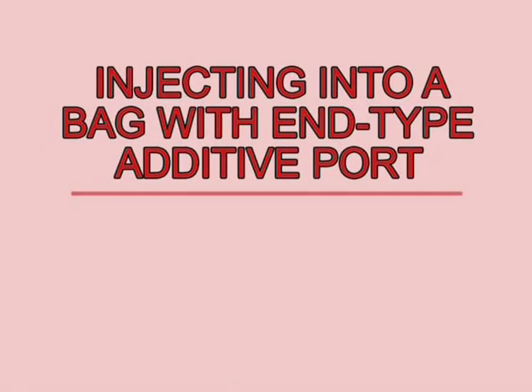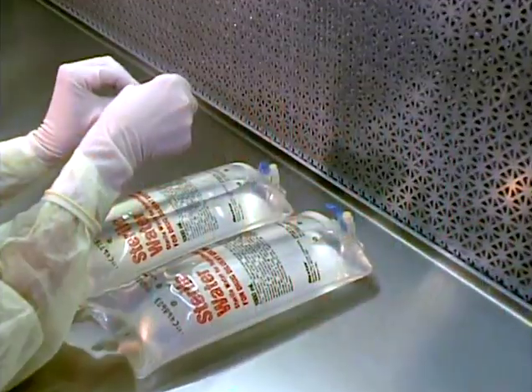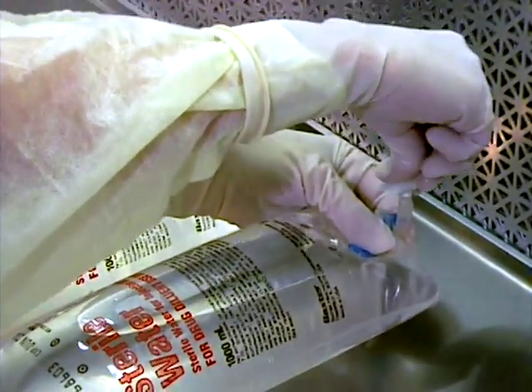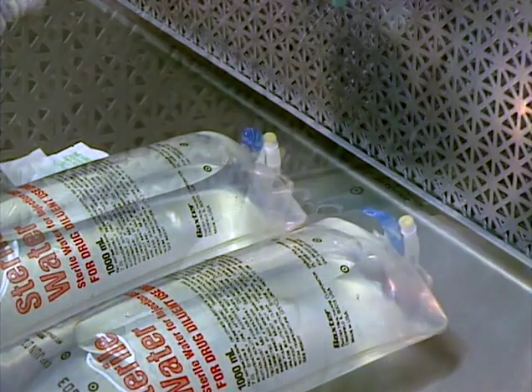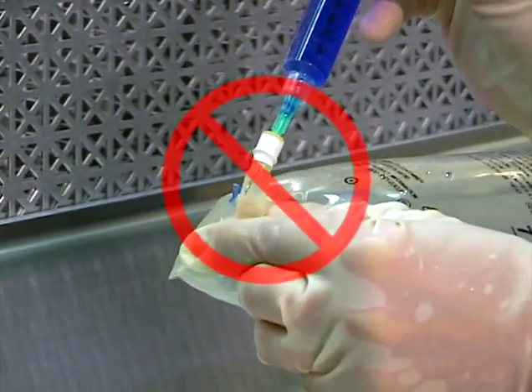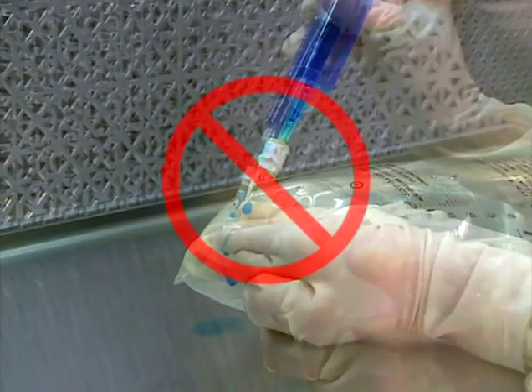Injecting additives into a bag with an N-type additive port. Risk factors for this procedure are similar to the compounding procedures previously discussed. Disinfect the additive ports and place each in first air to dry. When injecting into the port, be sure that fingers do not block the first air. Be careful to push the needle straight into the middle of the additive tube. It is very easy to force the needle through the back side of the tube, which will destroy the bag and may cause a painful finger puncture.